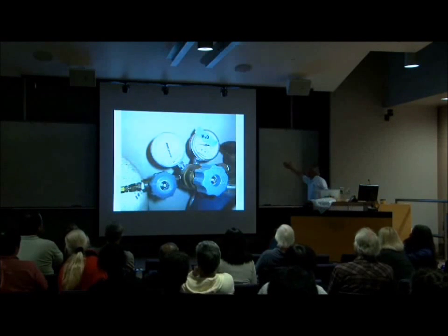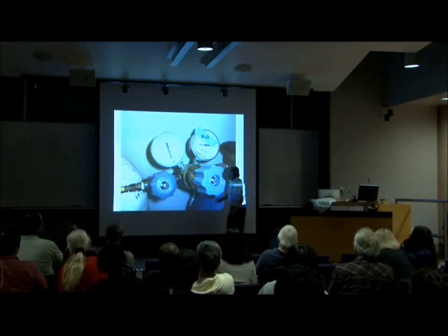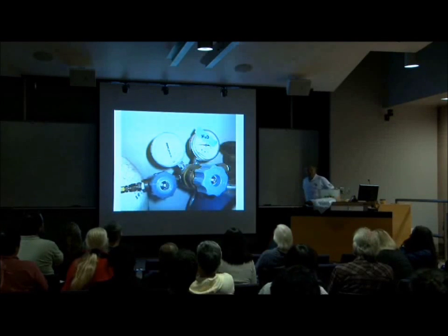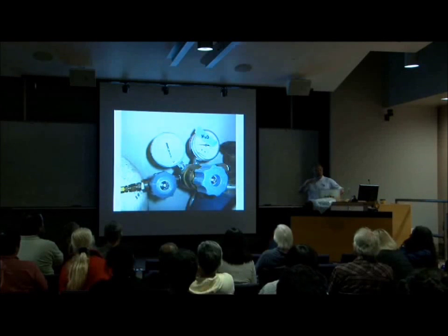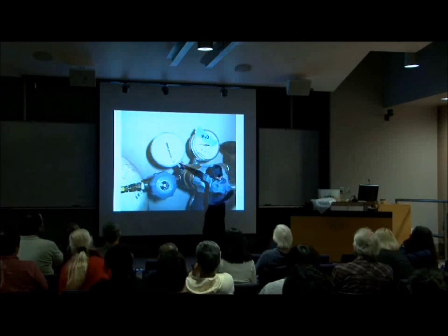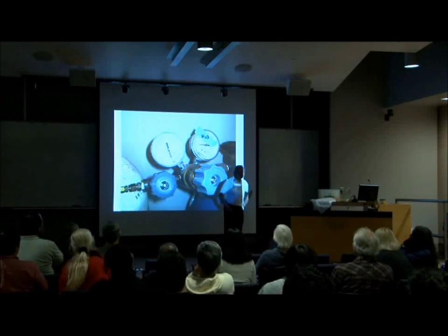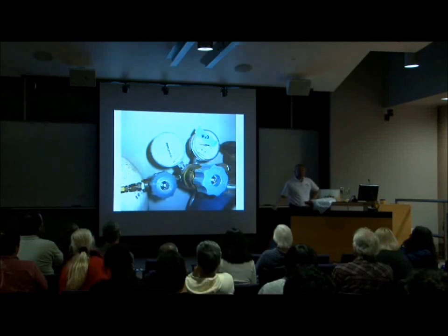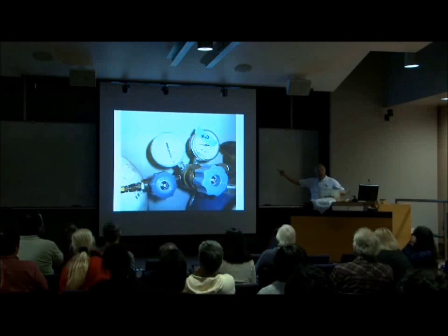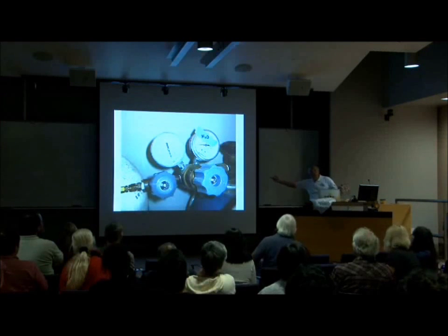Here's one. I walked around and did a safety inspection. What do you see here? When I walk around, I look at everything, and the gauge is blown. The researcher overpressurized the gauge, and it spun. That's what we call a spun gauge. Now it no longer works. So what's it telling them? It's not telling them anything. This needs to be replaced, right?